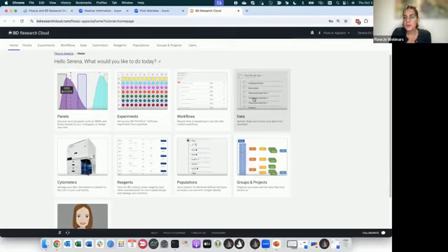Or if you want to share a workspace with colleagues, you don't need to save the FCS files and send them using an external tool. You can share information with your colleagues, either panels or data or workflows or experiments.